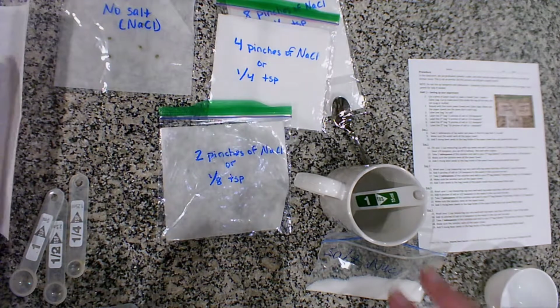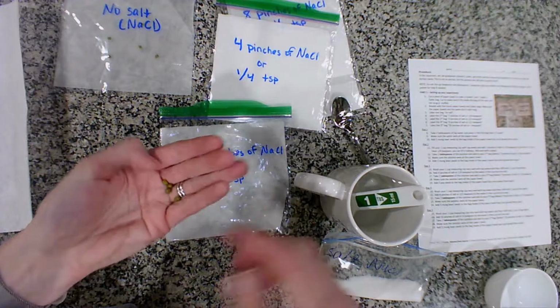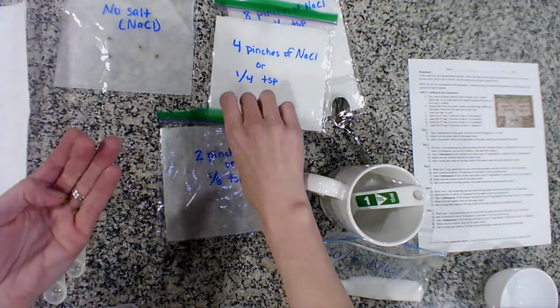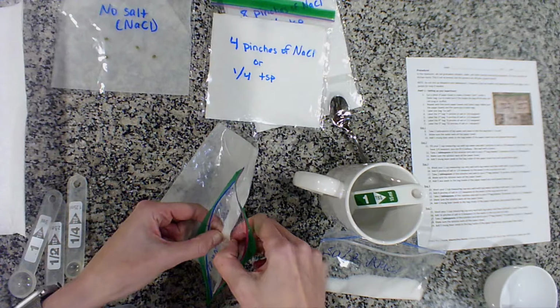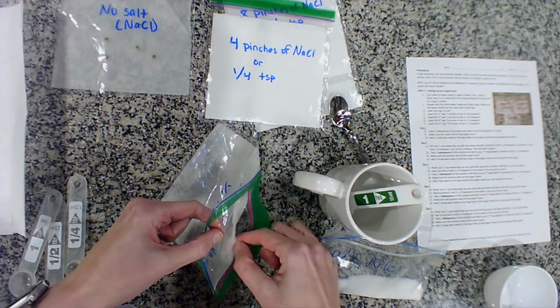Okay, then it's time to get 5 mung beans. 1, 2, 3, 4, 5. Open up my taco. Remember, this is the hard part. Be careful, this paper towel is already wet, so it's really quite fragile, actually.